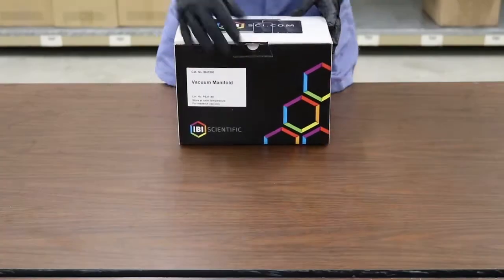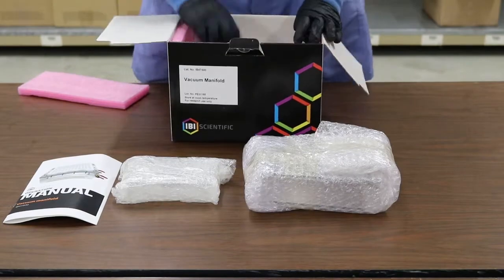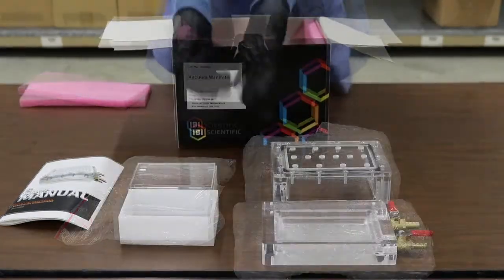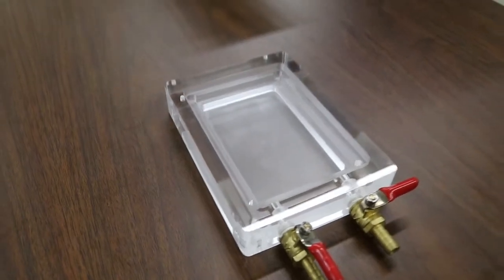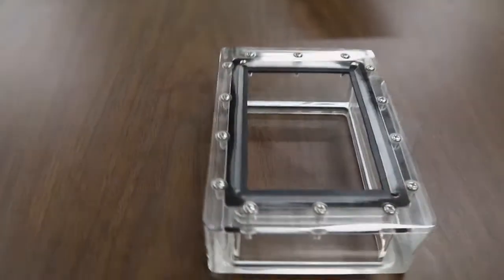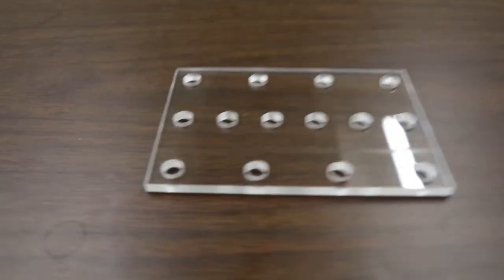IBI Scientific manufactures vacuum manifolds from machine-tooled acrylic bases and American-made valves. Your new kit comes with a vacuum manifold base, collection plate spacer, waste tray, vacuum manifold top piece, and spin column adapter plate.